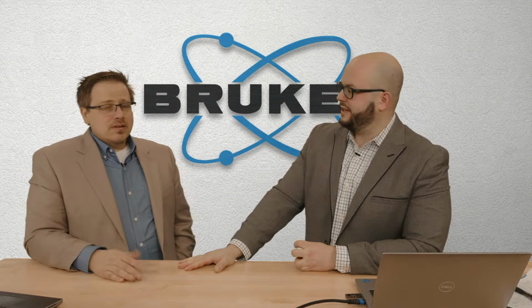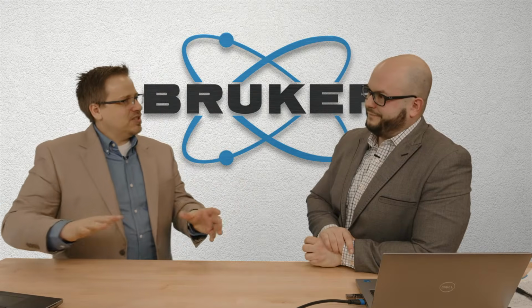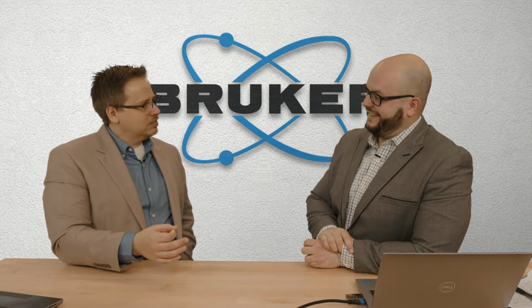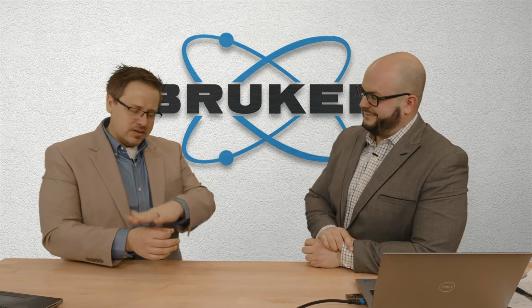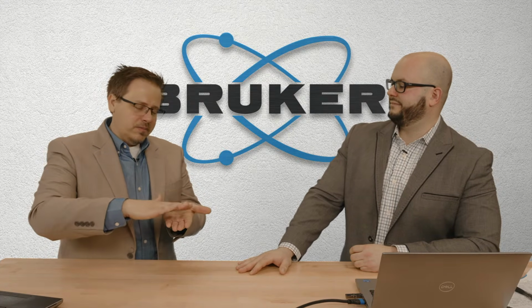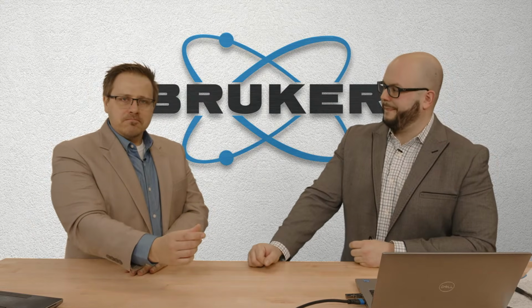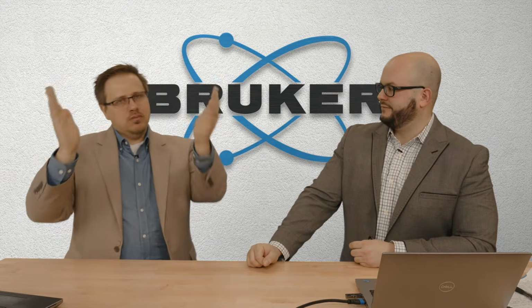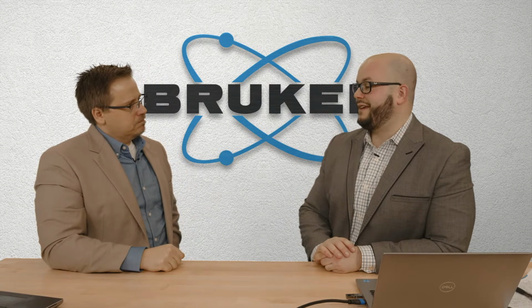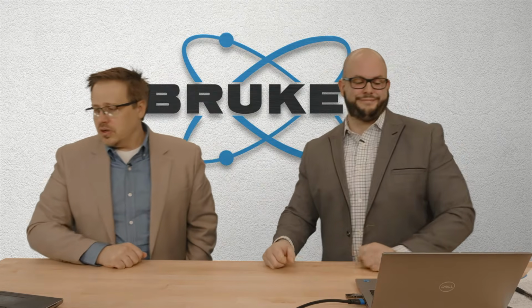So, makes sense. One of the things that's really useful, if you dig through the cabinet of things, right? Every machine has the cabinet of things. Sometimes you'll find a fluorescent sample. It's either going to be a metal puck with a white coating to it, or just a white piece of paper with a kind of orange peel, glowy, shiny coating. Take that, put it in your machine, and look at the beam. Then move the machine, just like you would in the measurement, and does the beam move? That's a very important thing, and that's one of the reasons that side inclination, when you're running 2D, can be beneficial. So, check that out.